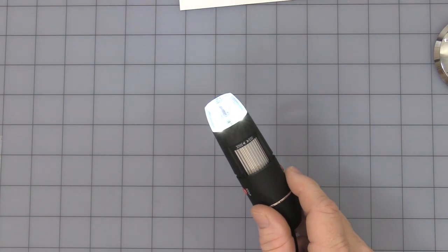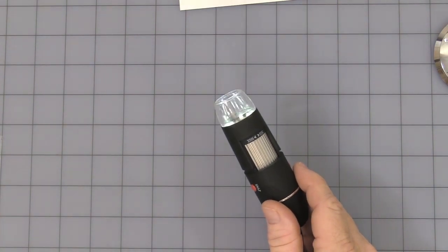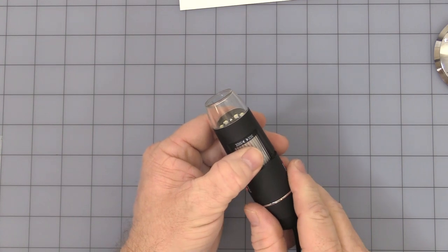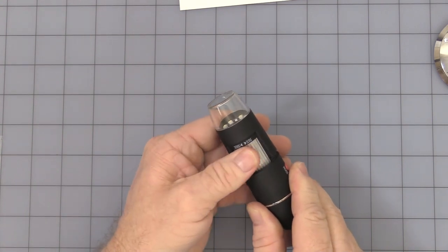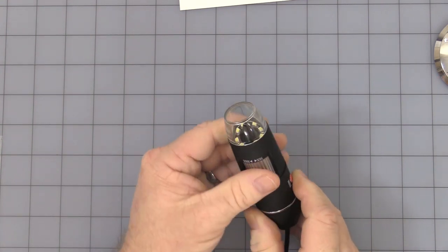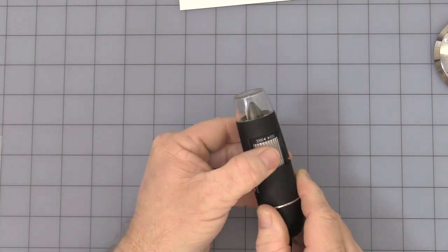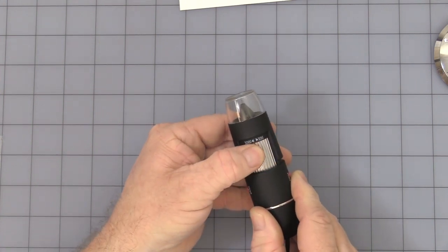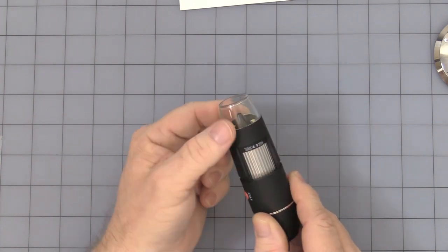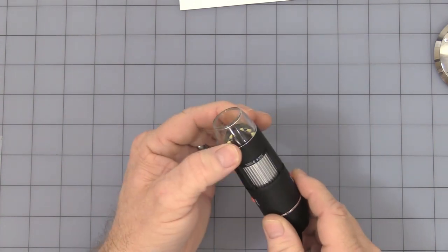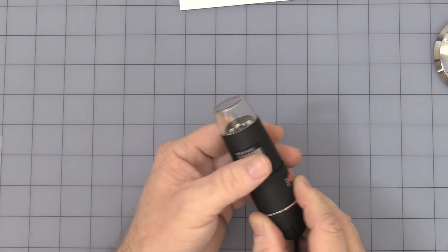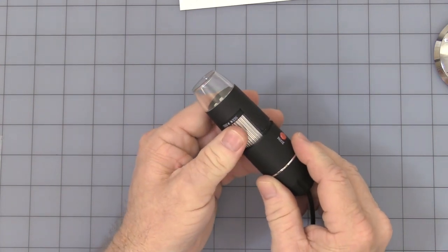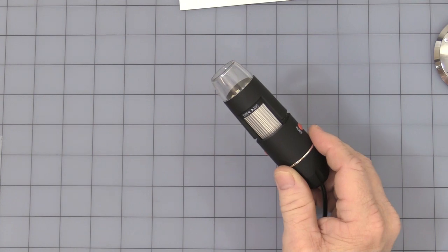Well, let me turn the LED light down some so you can see this here, because I've had a couple of questions about this. As you get at the really higher magnifications, you can see that little cone come down there. We've had someone ask if they could take that clear plastic off and work with it like that. You probably can. That voids the warranty though.